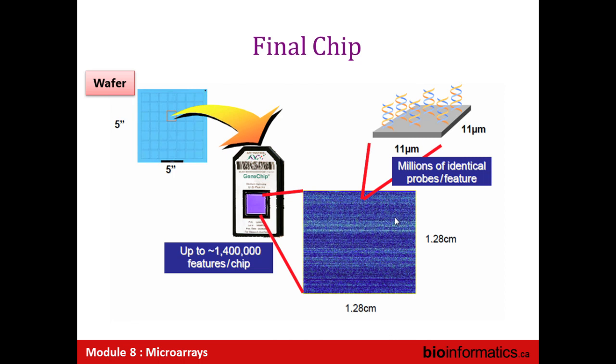And it's probably true that we are far more limited by the scanner, which allows us to detect 65,000 grayscale levels, than we are by the arrays, which potentially allow you to detect millions of different individual quantization levels. That was a question from Ashit.